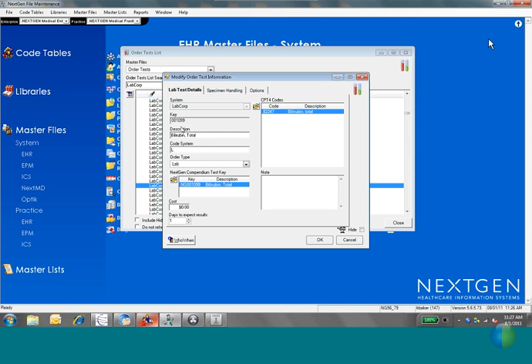Your lab test details tab is mostly going to be the 5 required fields, but most of you are going to link the next-gen compendium. Even though it's optional, I highly recommend doing it. The CPT code, however, is only needed if you're going to be doing the medical necessity piece. Oh, and I didn't mention down here, the cost is also for medical necessity.